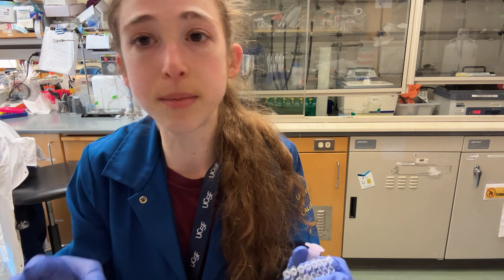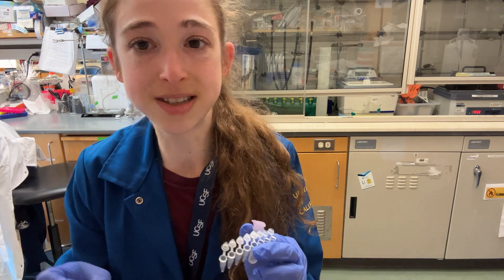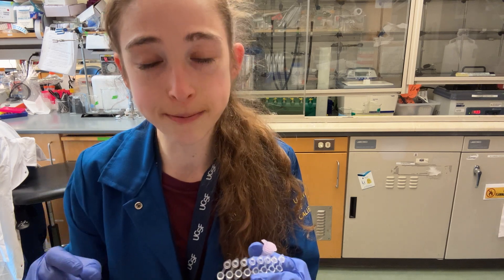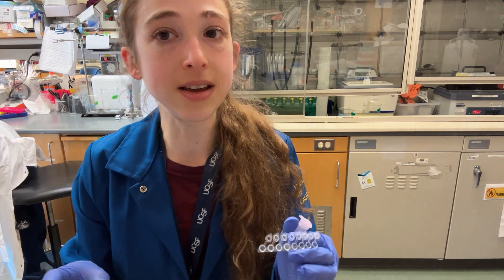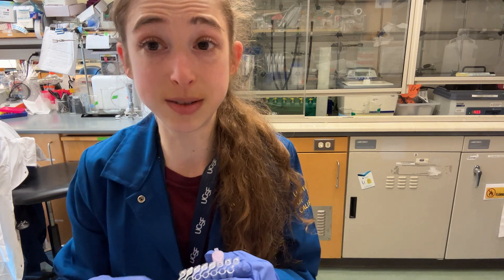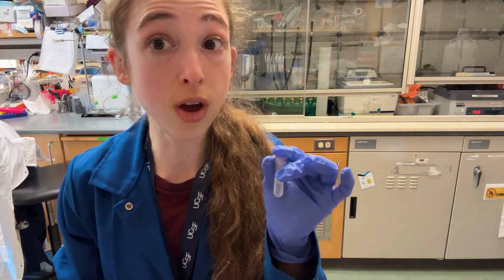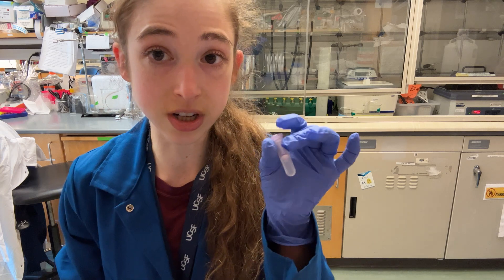Just increase the number of reactions that you do, and don't worry about trying to make each smaller reaction maximally efficient. Now, sometimes you might think you need more of your PCR product because you did your reaction, did your purification, and the concentration is too low. Well, if the concentration is too low — if that's your problem and not the actual amount — what you can do is just elute it in a smaller volume when you do your PCR purification column.